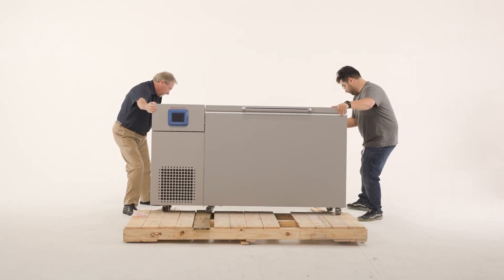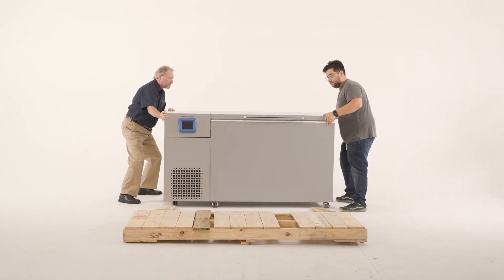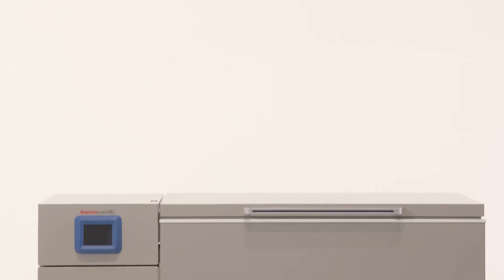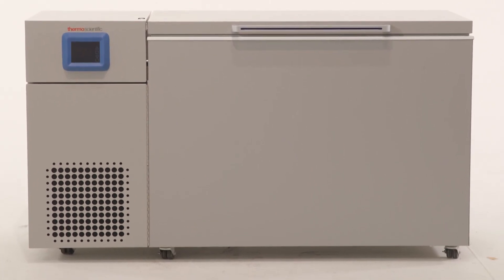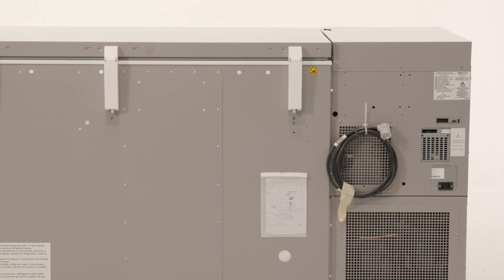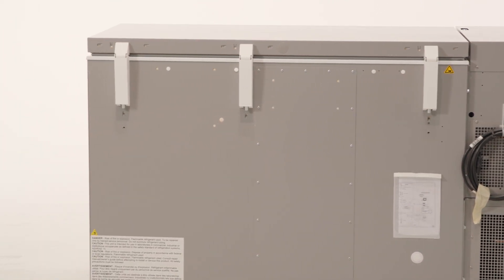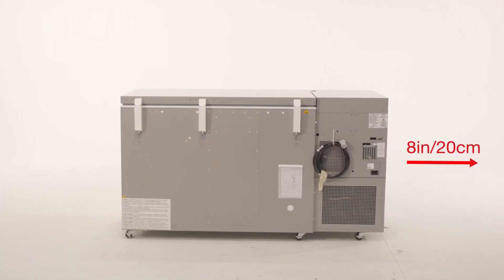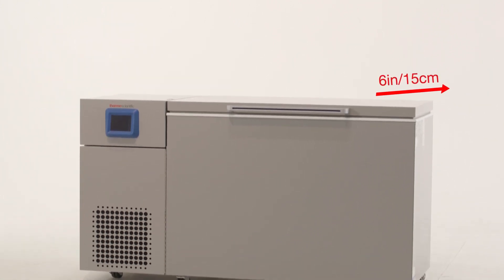Before moving the freezer, make sure the casters are unlocked and moving freely. Align the casters with the ramp boards. Be sure to use adequate personnel to roll the freezer off the pallet. Locate the freezer on a firm, level surface in an area with an ambient temperature between 18°C and 32°C. Install the unit in a level area free from vibration with a minimum of 8 inches (20 centimeters) of space on the sides and 6 inches (15 centimeters) in back.